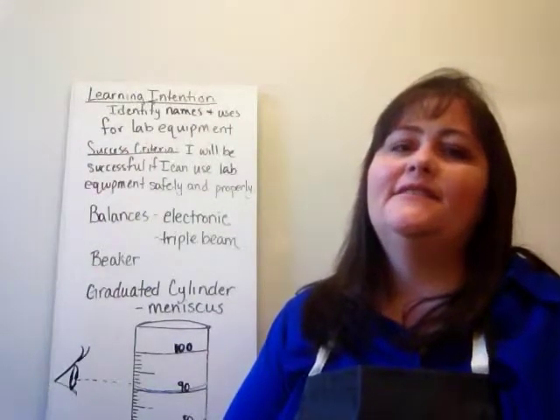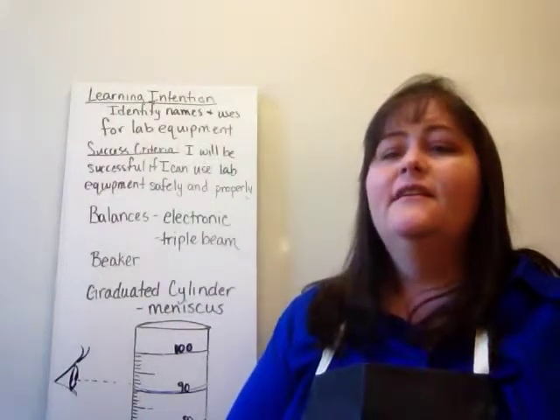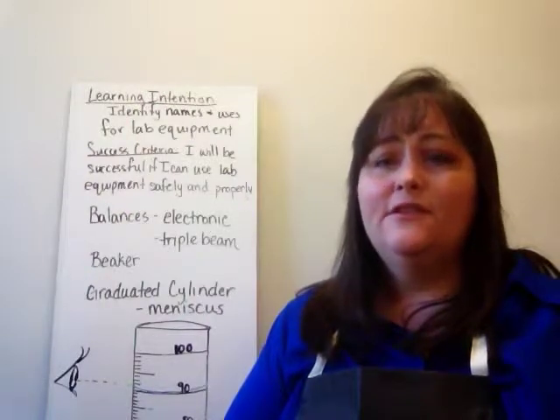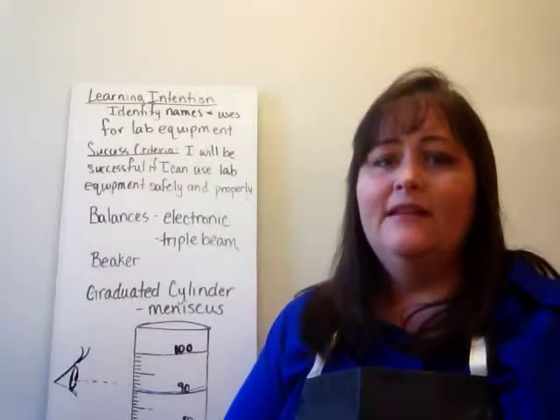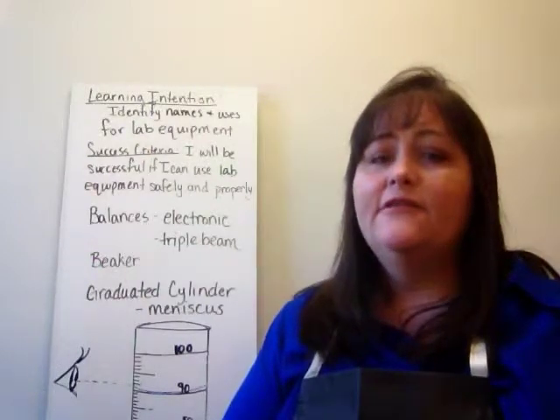Hi guys, today's lesson is going to be on using lab equipment safely and properly. Your learning intention says that you're going to identify the names and uses for lab equipment, and to be successful you should be able to use that lab equipment properly and safely in the lab.